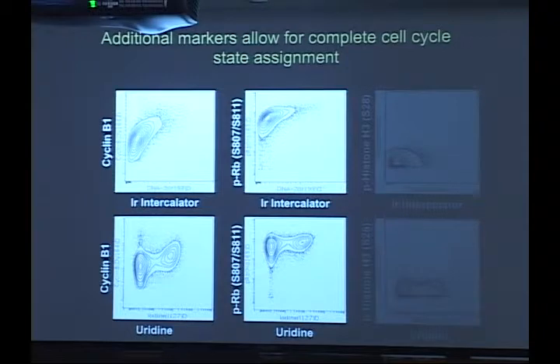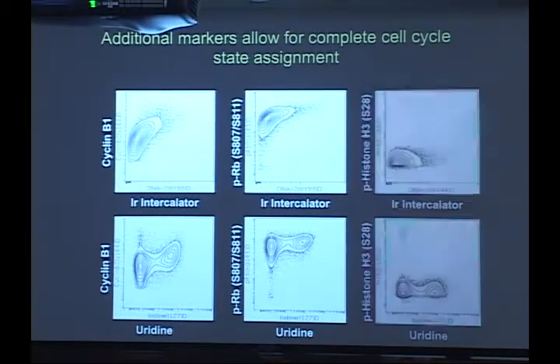If we look at phosphorylated RB, this is a site, 807, 811, that gets phosphorylated during the transition from G0 to G1, as opposed to what you're typically used to as a G1 to S phase transition. And there's a Cell paper about this from like 2008, I want to say, or 2006. But again, when we pull out the S-phase cells, we can use that population to define the level of IdU that's necessary for a cell to be in cycle, and then we can pull out a G0 population.